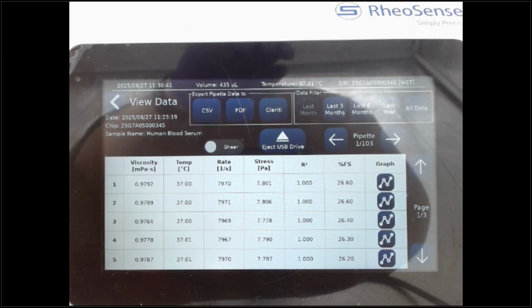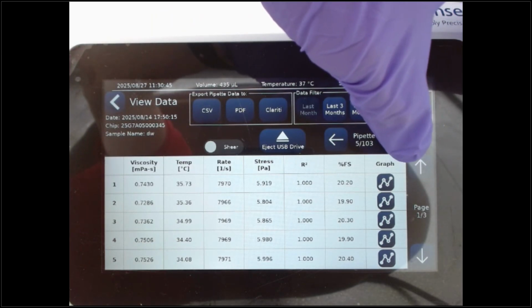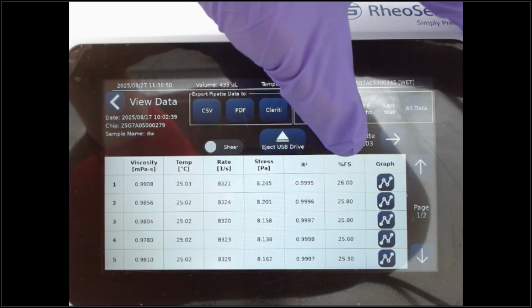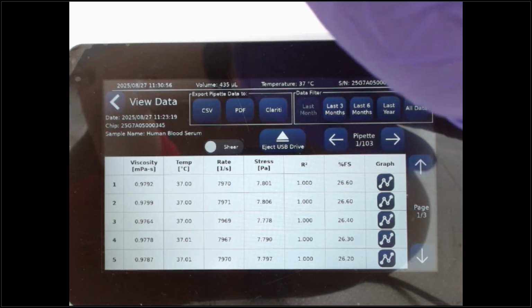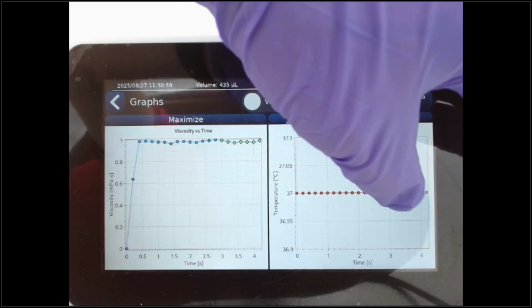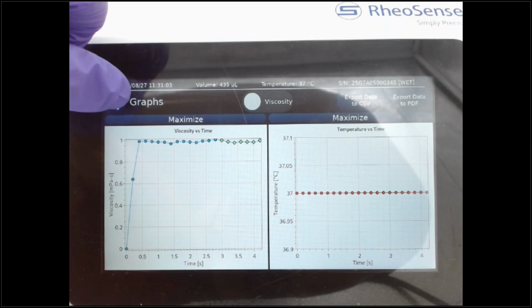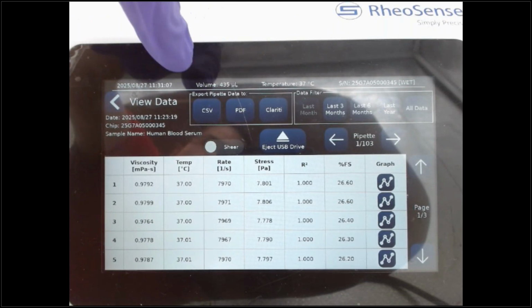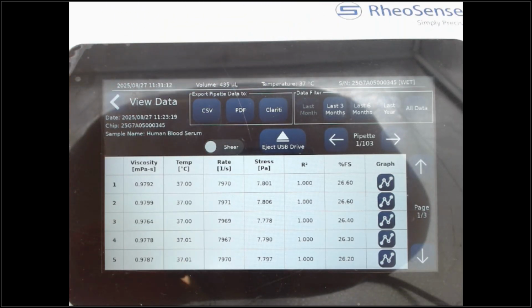You can go back and forth between the samples that you were running, between PBS and so on. Let's go back to that one. You can filter based on the date range, and then you can also look at the plots of all your measurements. If you go there, we can see everything is stored. Then you can quickly export all this data to your drive. So right here, export data, multiple file types. You click and it allows you to do that.